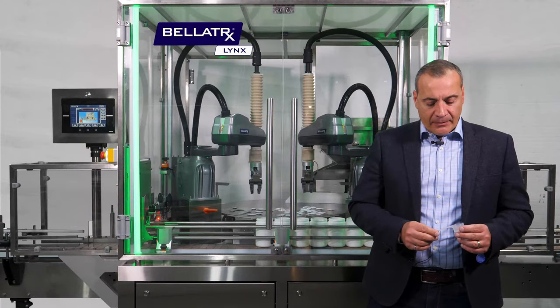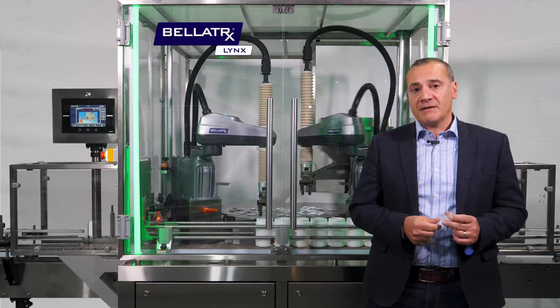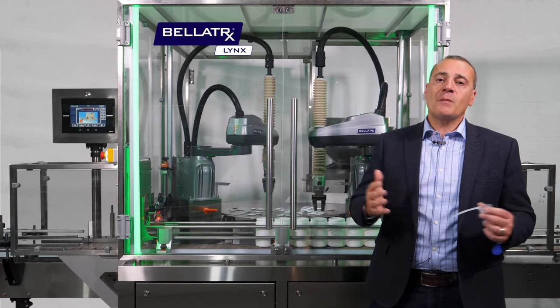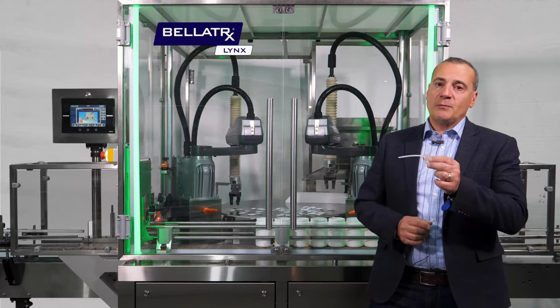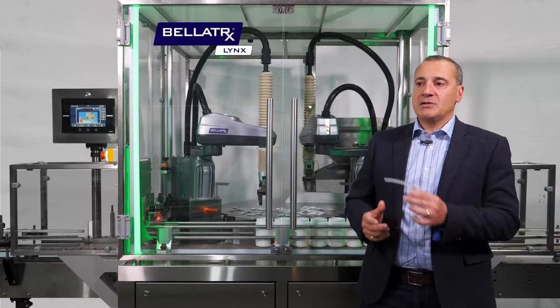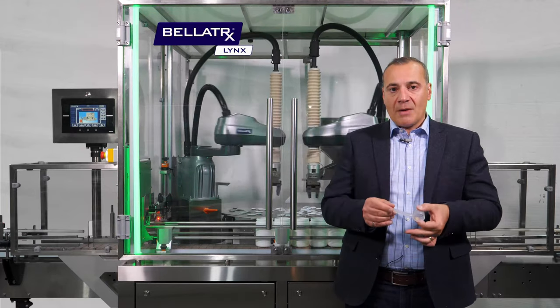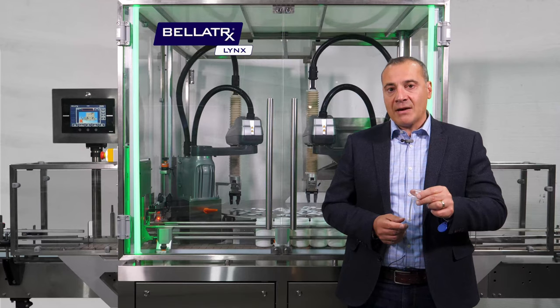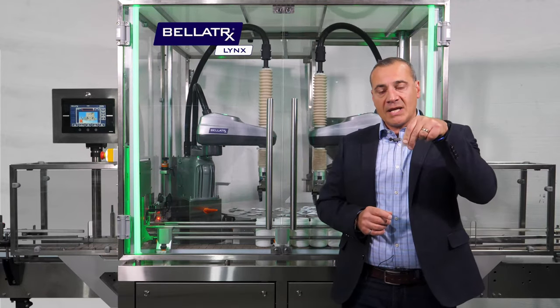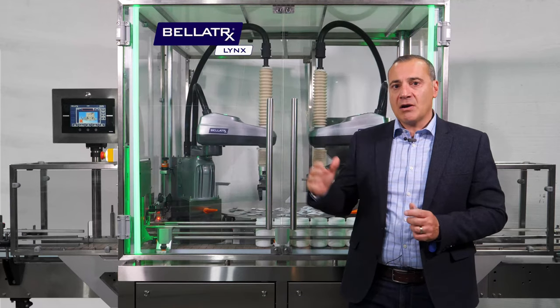Question one: regarding inserting scoops versus dropping them into the neck of the bottle, is there a difference in configuration? Yes, absolutely. We can choose different degrees of movement of the robotic arm to match the application. If I need to just drop a scoop into the neck of the bottle, it requires fewer degrees of freedom. But if I need to press it in, I need the arm pointing downwards, which requires a wrist equipped on the robotic arm that allows us to pick it up, rotate it, and press it down into the neck of the bottle.